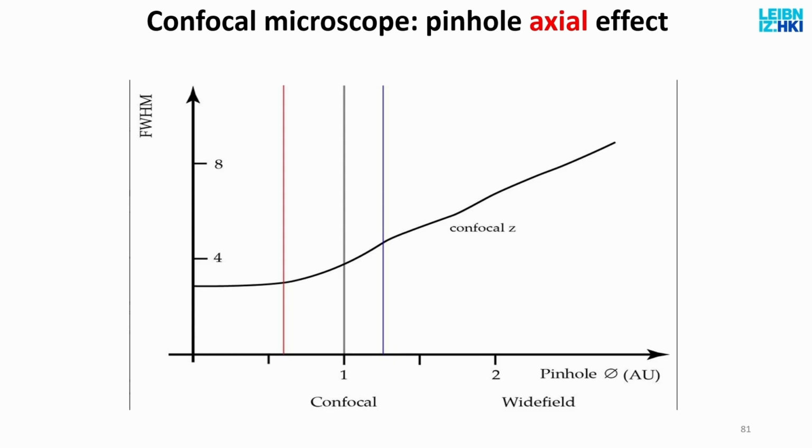The idea is that, have you guys ever seen a Moiré pattern, where you have two grids and you rotate them relative to each other and then it starts to reveal periodic patterns at a much larger scale? You can Google it. This basically means that two periodic structures result in a new pattern with a much larger size.